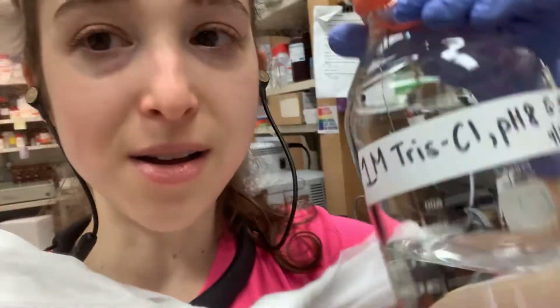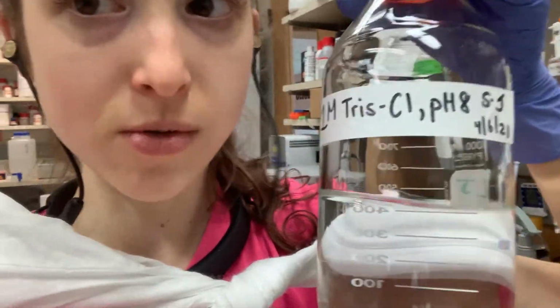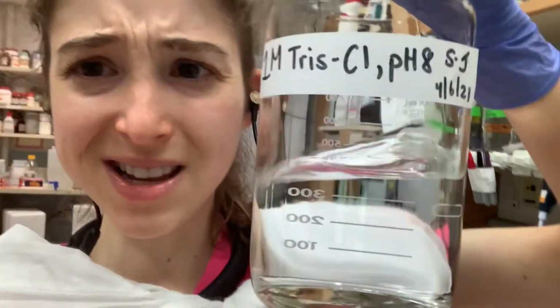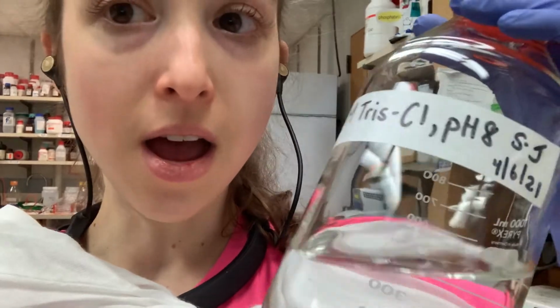In addition, having a high concentration stock solution means you don't have to dissolve the acid and base every time you want to make a buffer. So you have to do it once for your stock, but most of the time we're not going to use just the buffer as is. We would never put our protein straight in this. Instead, we put it in a solution with salts and the various things that the protein might want, and at a much lower concentration of the buffer.